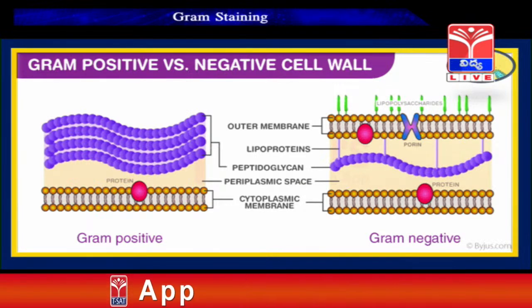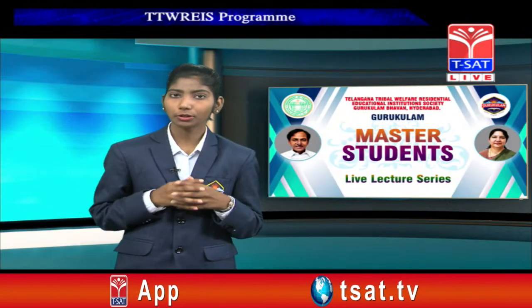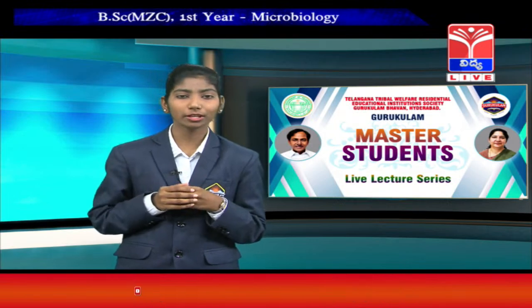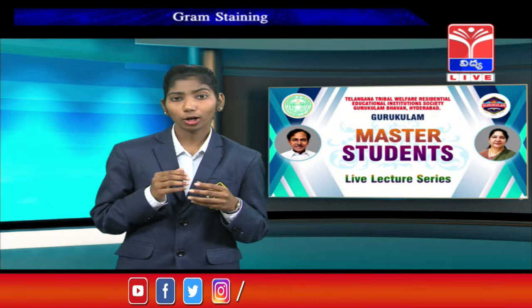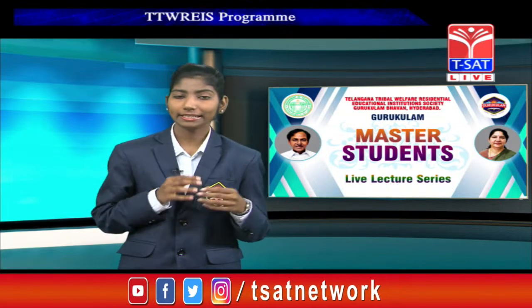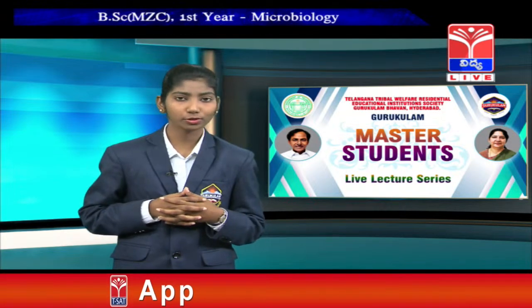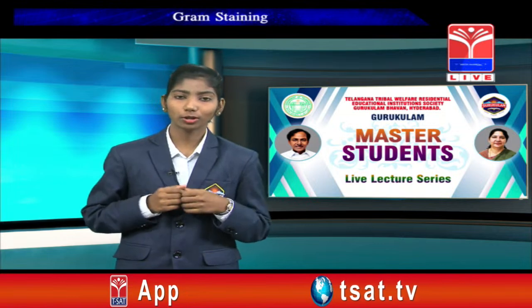Exactly, stains are colored substances which are useful to visualize microorganisms under a microscope. The organisms which can't be seen with our naked eye, and can be seen only under a microscope, are known as microorganisms.